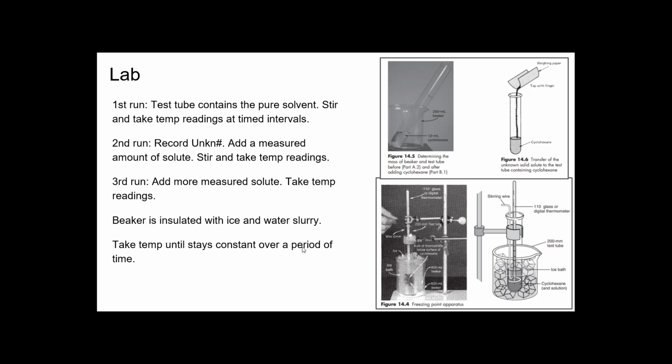Now, I'm not going to go too much into this. These pictures are from the lab that I do at another school, and it's a little bit different than what this lab is talking about. Basically, you're just freezing your solvent with your solute, and you're collecting temperatures while you're making additions to the solvent. So you can see the temperature being depressed. It's going to start going down.